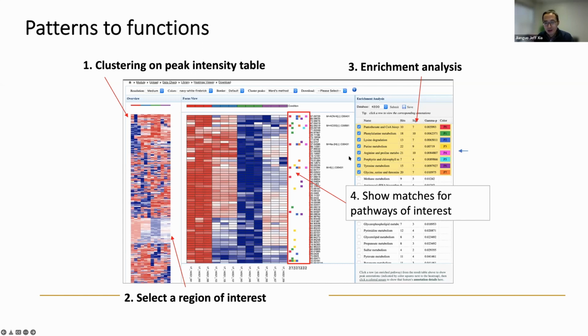And we can actually test what the potential pathways underlying these patterns are. This is phenylalanine, lysine, purine, and so on. We continue testing. Recently, we used higher resolution. Once we used ICR, one of the high resolution instruments, we actually got much stronger hits. It's quite interesting to see the high resolution features show up here, and it all seems to make sense. So this one really requires user input. You see the patterns, you want to find more, so you need to select and show this, then test the pathways.